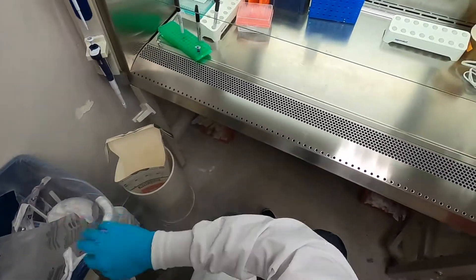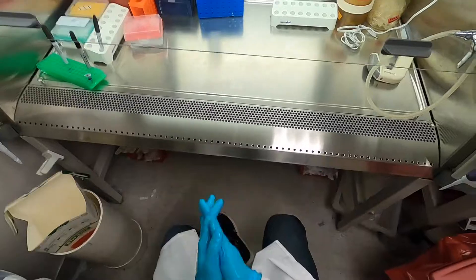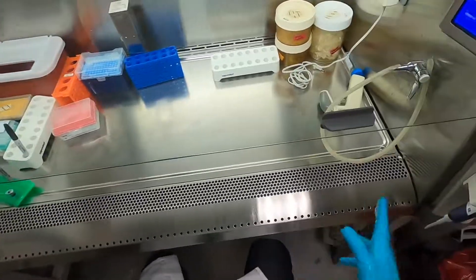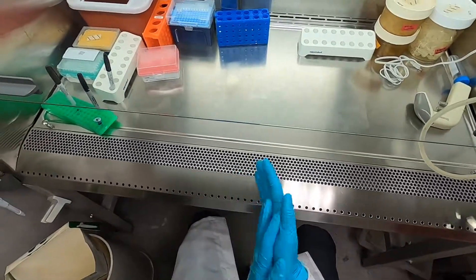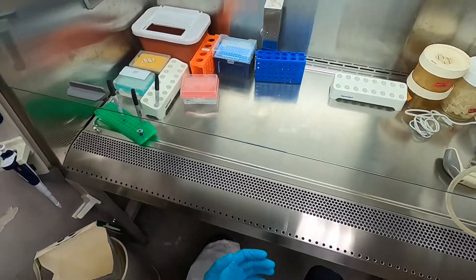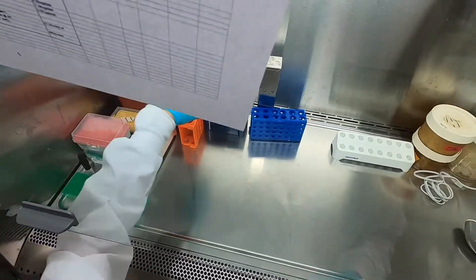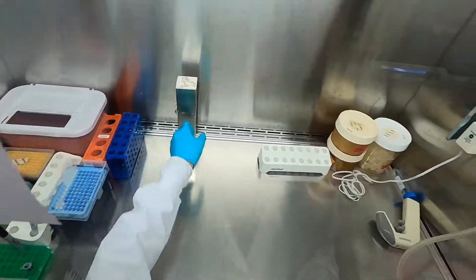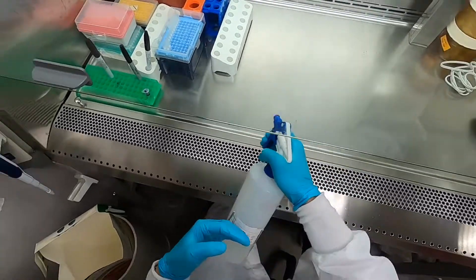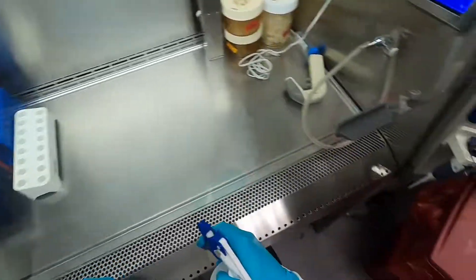I'm here today in the tissue culture room. The first thing to do is open the hood up to the correct sash height, which is usually indicated on the sides of the hood, and let air circulate in the biosafety cabinet for up to 10 minutes before you start doing any work. Since I wasn't the first person here today, all I need to do is organize the contents a little bit and spray all of the exposed surfaces with 70% ethanol.